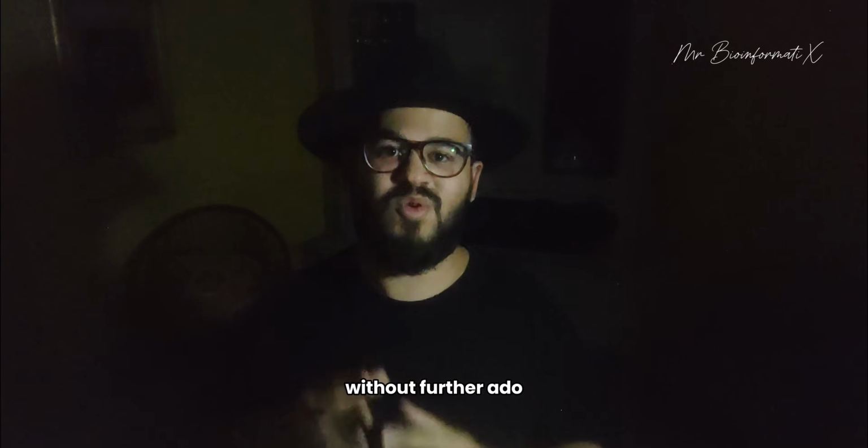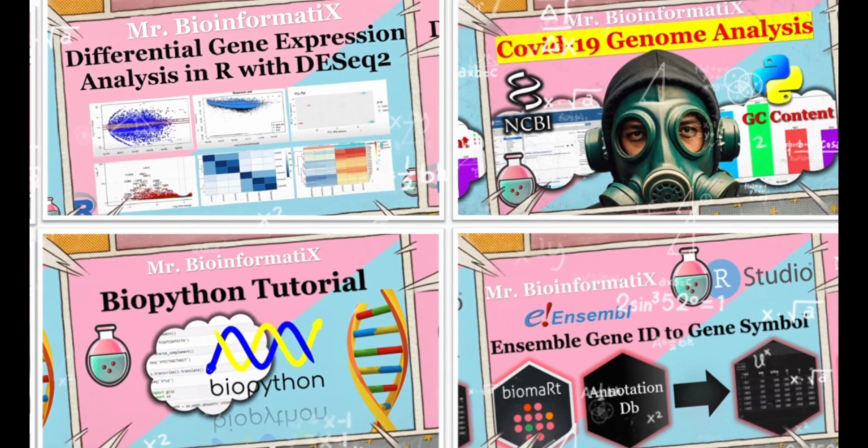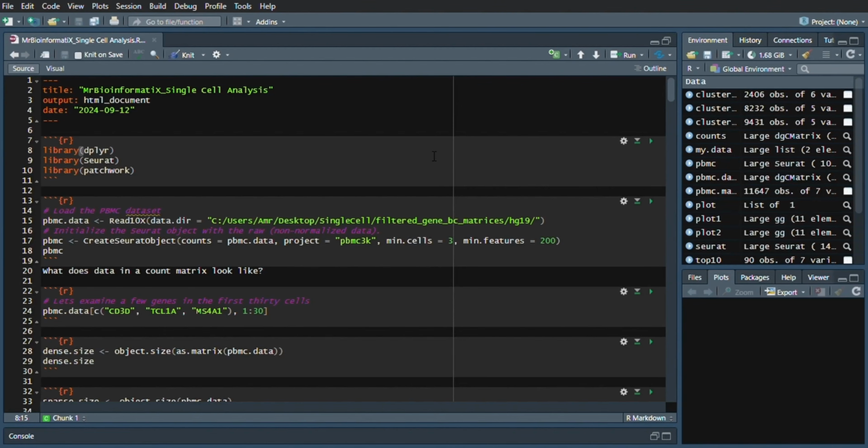Without further ado, let's get started. Firstly, we upload our libraries. We have dplyr, Seurat, and Patchwork.